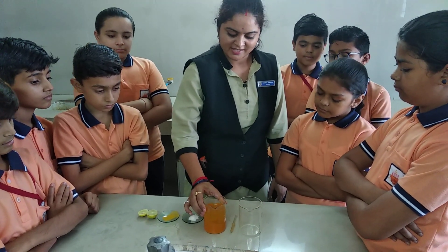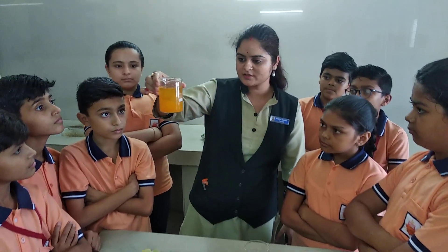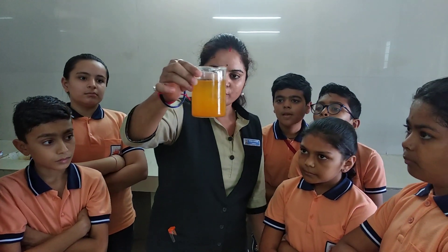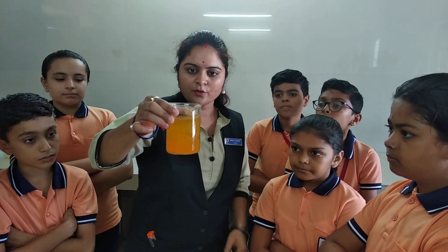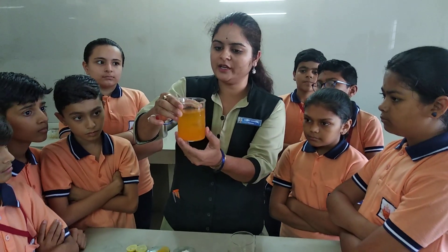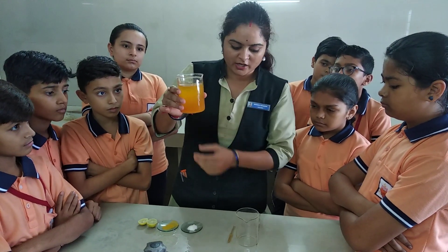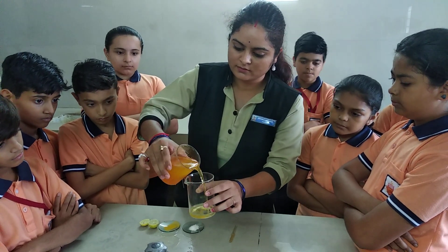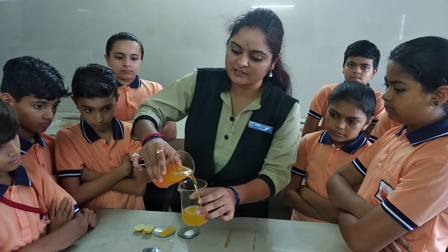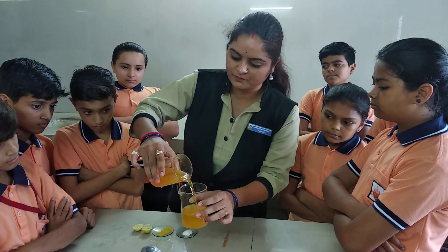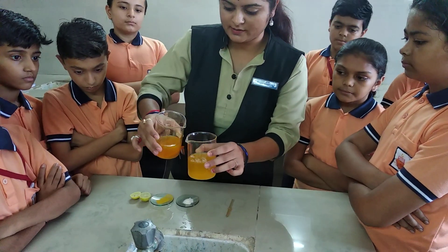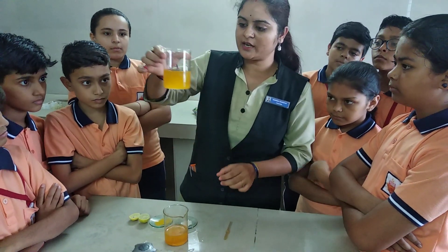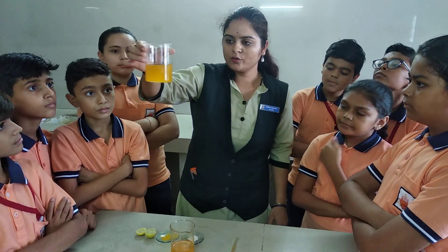Now we have to take this beaker and slowly pour this water into another beaker like this. We have to decant this mixture. Now here we are having the clear turmeric water.